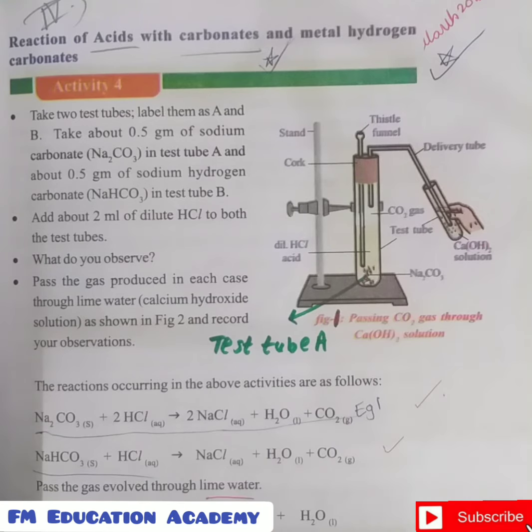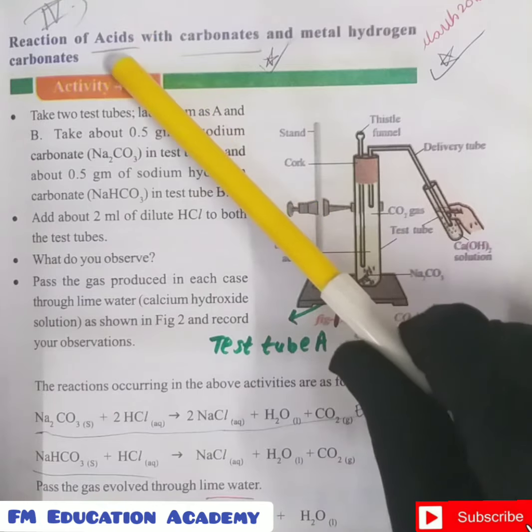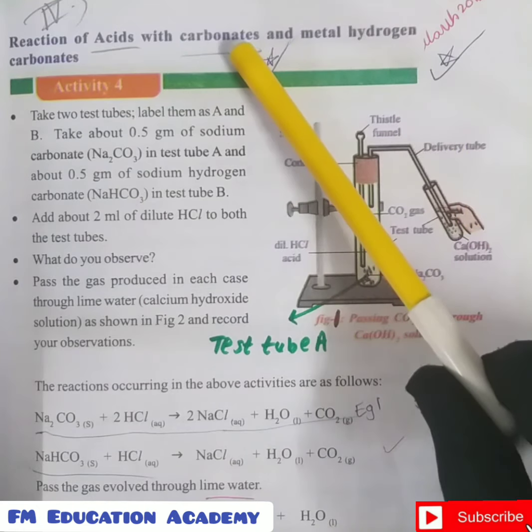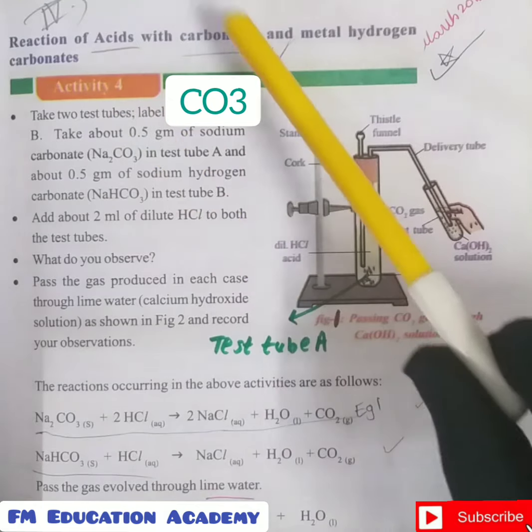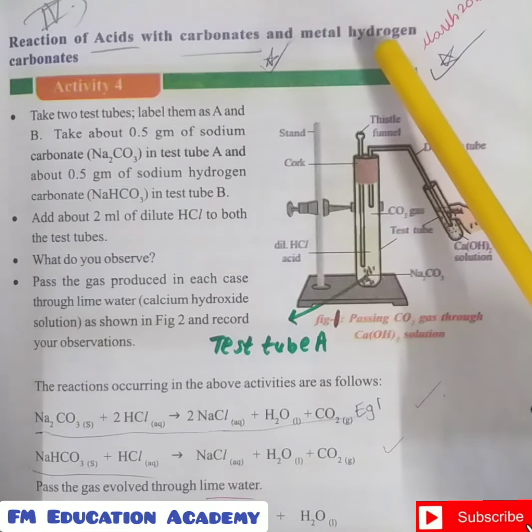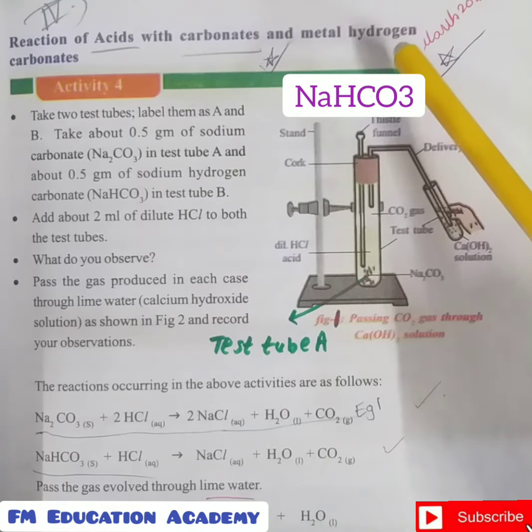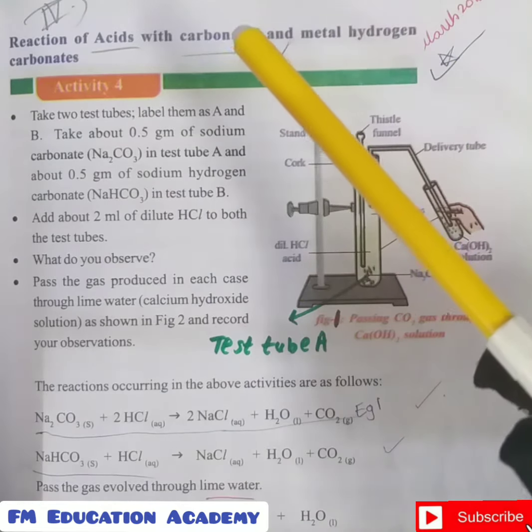So the activity is, we have to perform an experiment in order to find out how acids react with carbonates and how acids react with metal hydrogen carbonates. What do we mean by carbonates? The chemical formula of carbonates is CO3. And what is the chemical formula of metal hydrogen carbonates? HCO3. So we are going to see in this video lecture what will happen at the product side when they react.